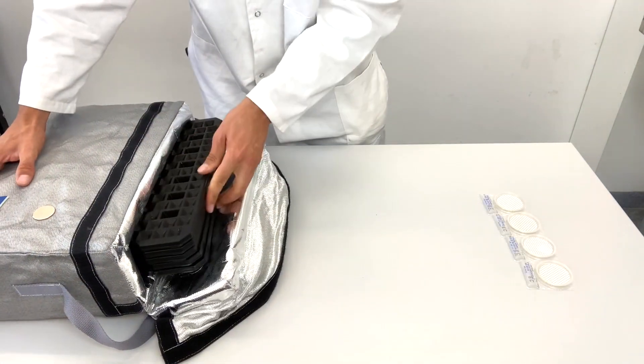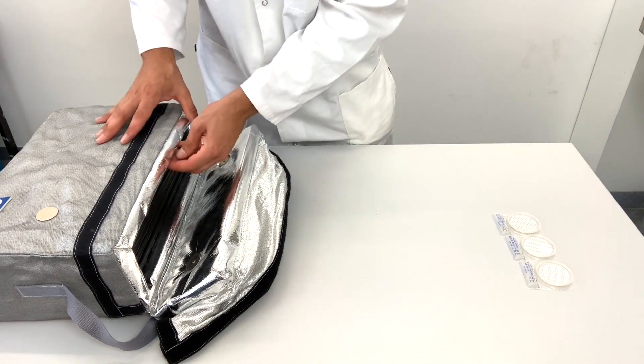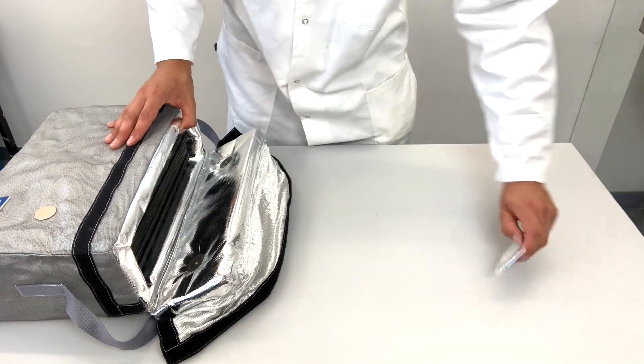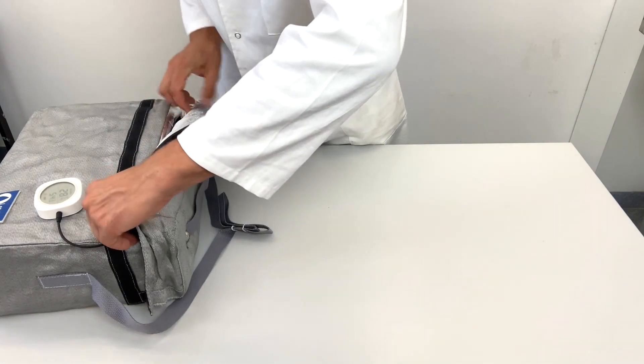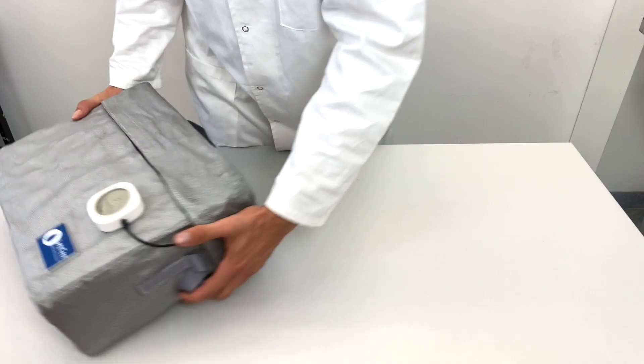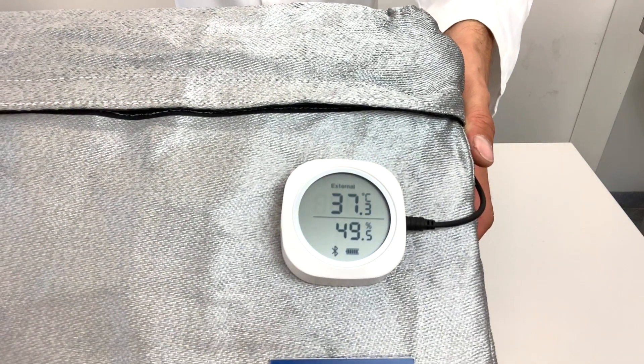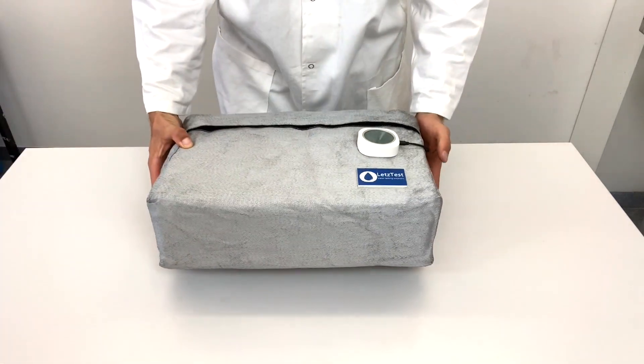Now place the plates flat side up in the incubator and slide the petri dishes topside down into the incubator at the very top. Then place the temperature sensor nearby, close, and keep the incubator in horizontal position. The incubator will keep the temperature stable at exactly 37 degrees for 24 hours without any electricity.